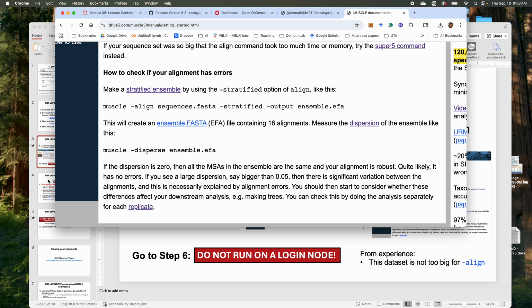Well, so what I want to see is that you interact, named the input file correctly, and then you've included the stratified flag, and then the threads flag is the last one. And then put that in a text file so that you can just copy paste it into your terminal when you're ready.